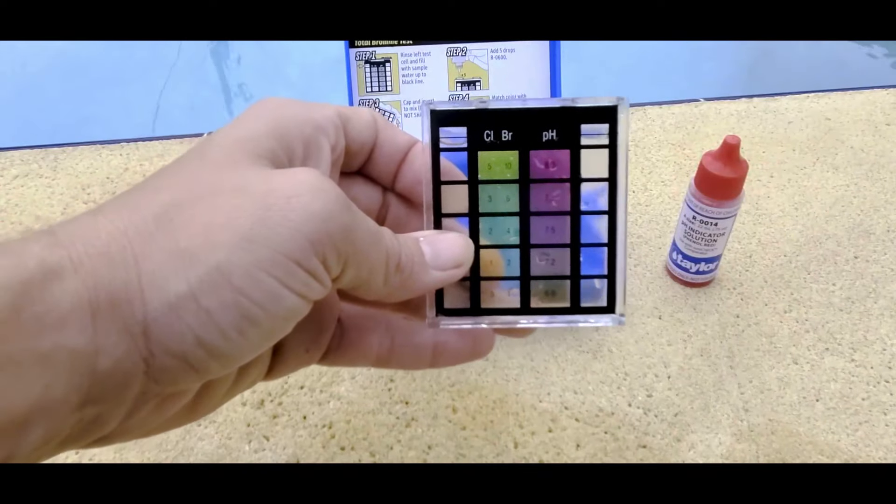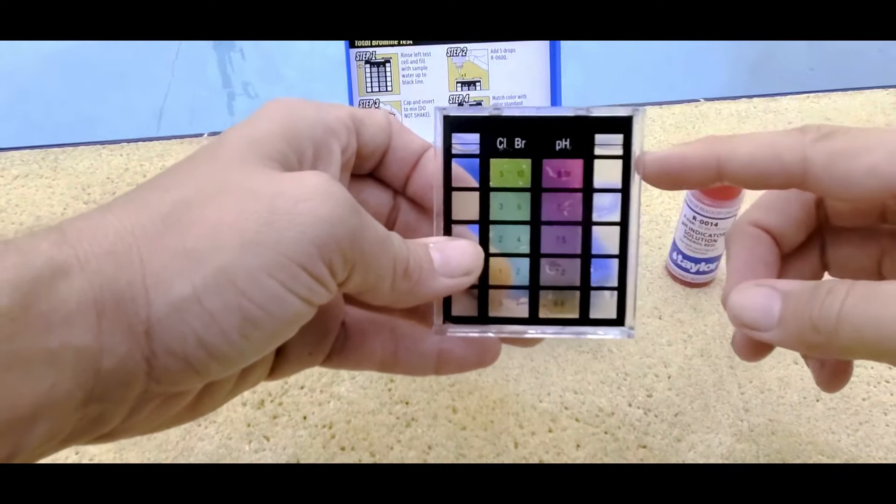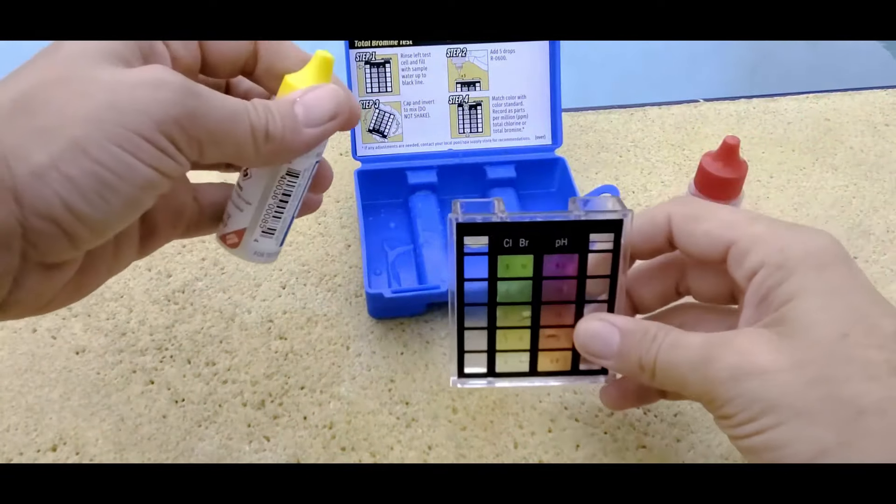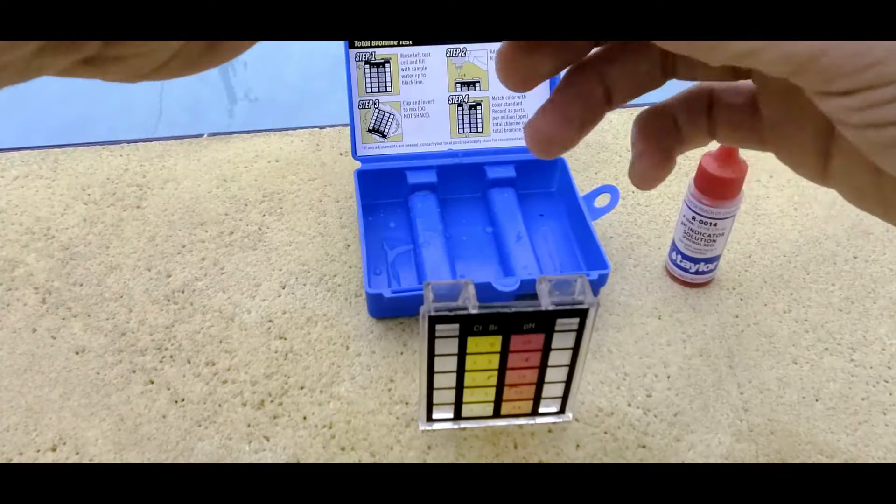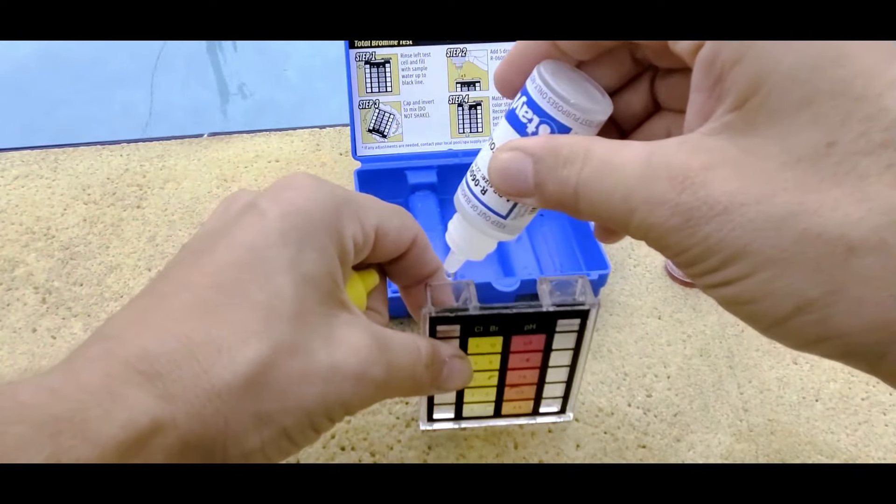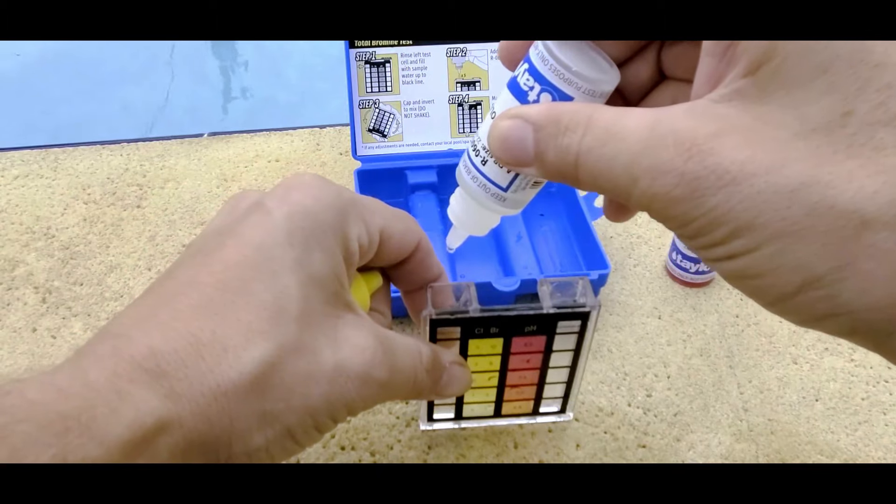Alright, so I've filled it up with pool water up to the line here on both sides of this. So we're just going to go ahead and do a quick test. So I'm going to add five drops of the chlorine dye solution. One, two, three, four, five.